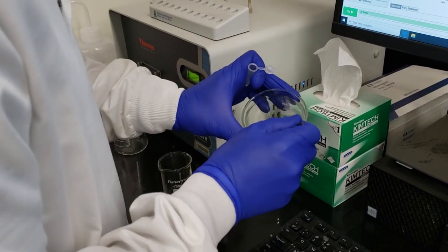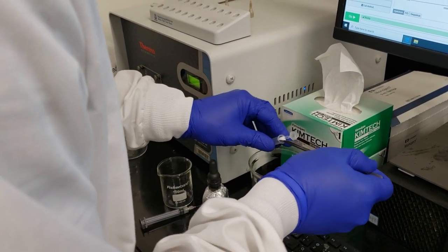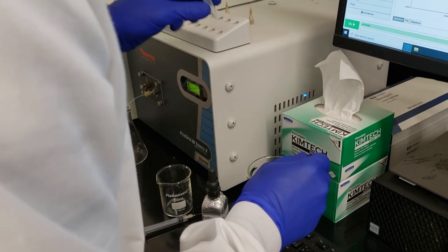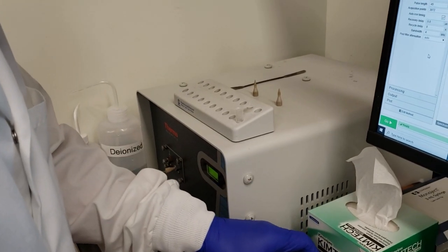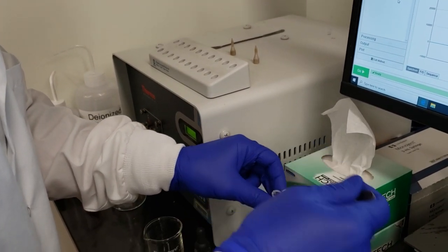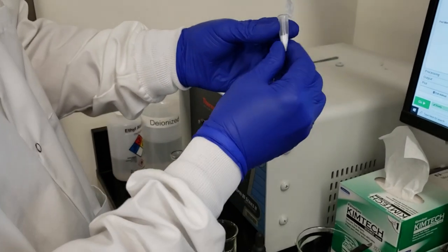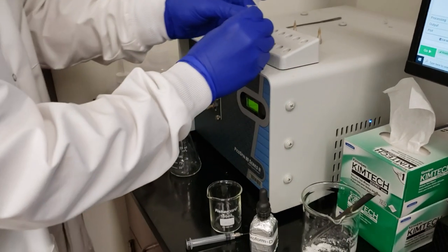So let me go ahead and get a little bit of these crystals here. A little bit more. Set this up in our holder here for a second. And that should be more than enough. I'm going to tap it down a little bit. That should be more than enough to give us a good spectra here. So I'll set this in the holder.